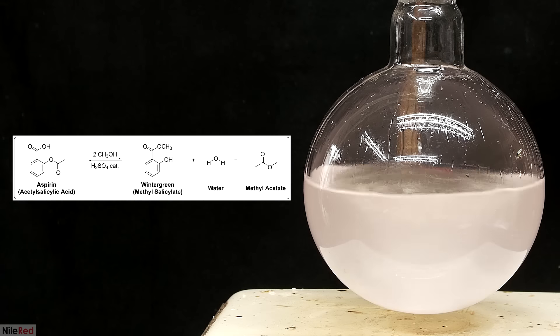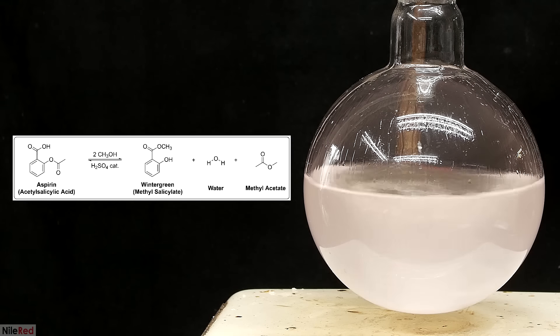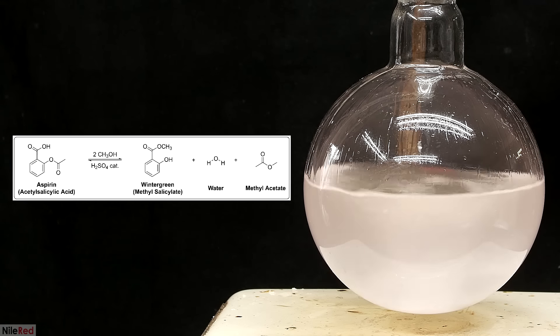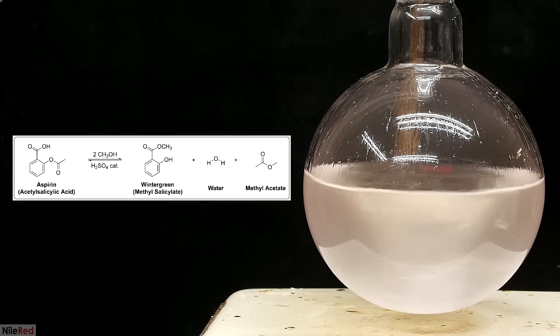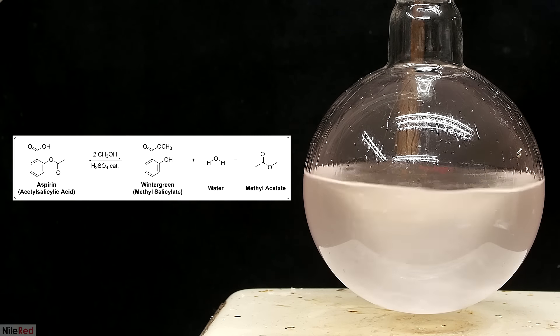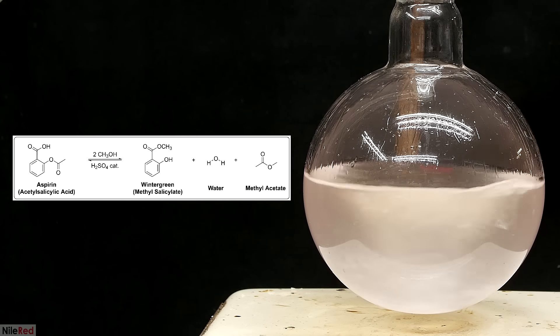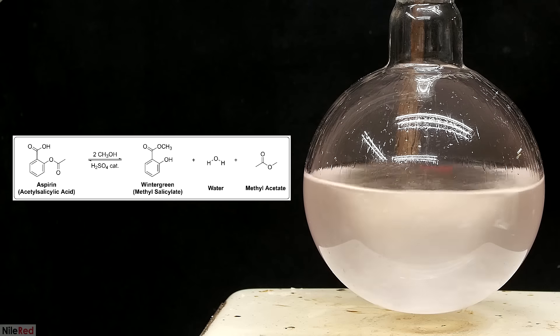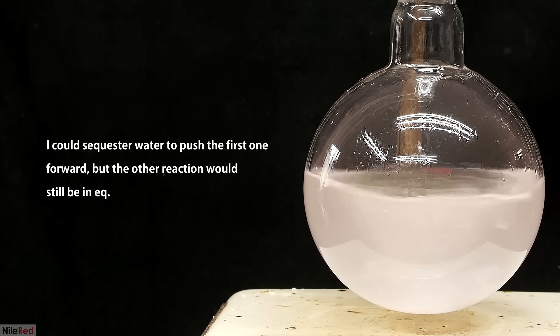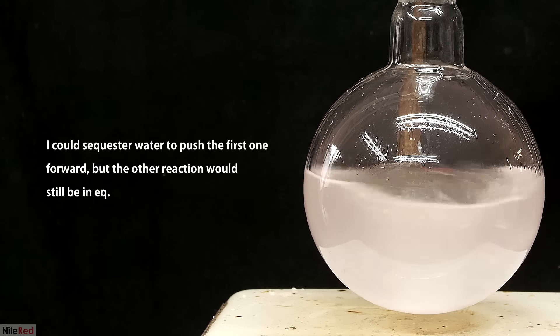One important thing to notice about this reaction though, is that it's in equilibrium. This means that the products can react together to re-form the starting materials. To try to favor the products though, I include a large excess of methanol. With so much methanol around, the forward reaction should be statistically more likely to happen. However, the overall efficiency of this process still isn't very high.